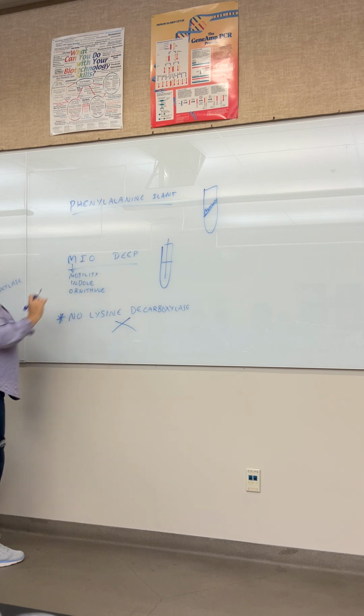So this test, microbiologists love it because we get 3 results in a single tube. That works really well for us. So imagine like over here, we did our glucose, lactose, and sucrose. We had to do 3 different tubes. But over here, in just one tube, I get 3 different test results. That's a lot of bang for your buck. So we all like these.